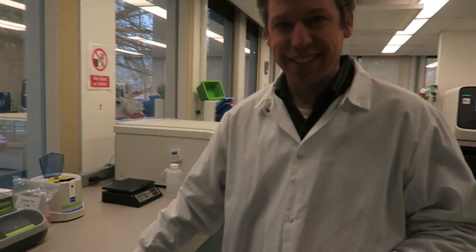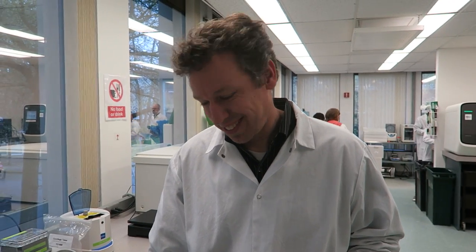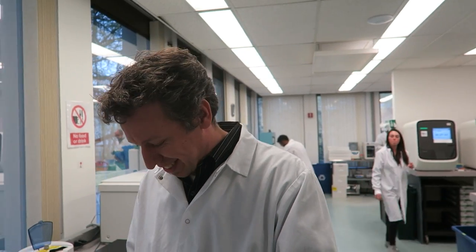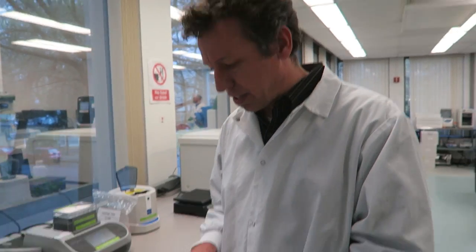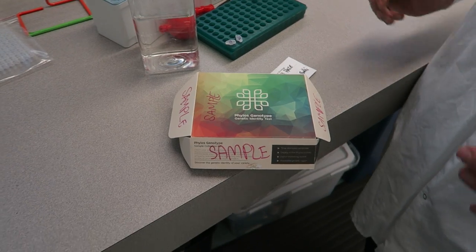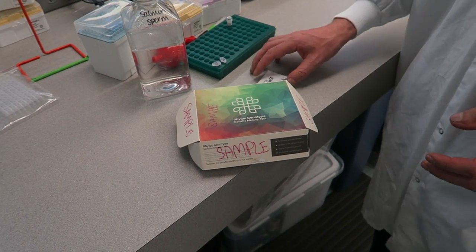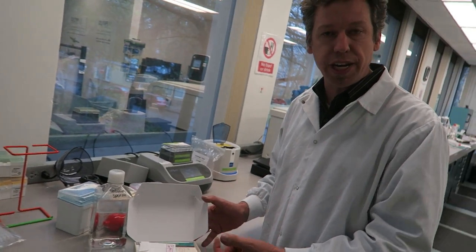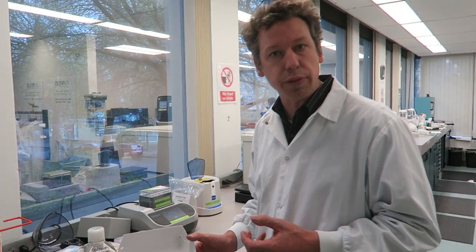So Nishan, what happens here when you have a sample and you want to send it in? Because one of the big problems is putting dope in the mail is a dumb idea, right? Exactly. So we have a kit that we sell online or through resellers, and you can see the resellers on our website or register online for yourself. What this kit does is it allows you to prepare a sample — it has everything you need to prepare a sample to send it legally through the mail.